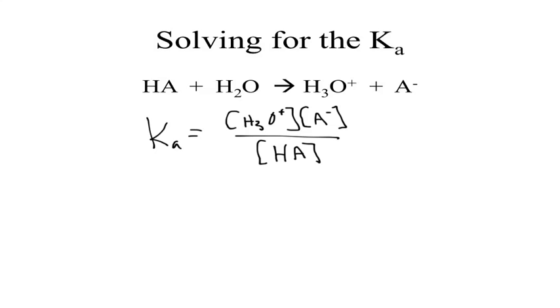But we want to work smarter, not harder. In the process of doing this, what are we monitoring during our titration? The pH. How do you determine the pH? The negative log of our H3O+.